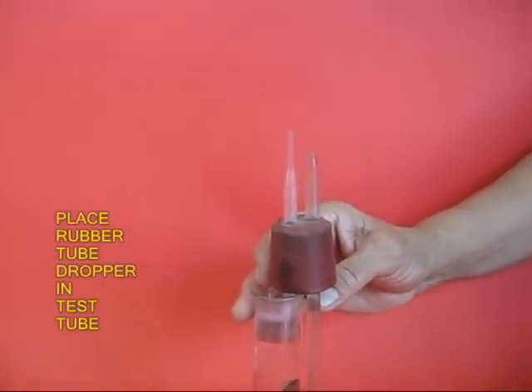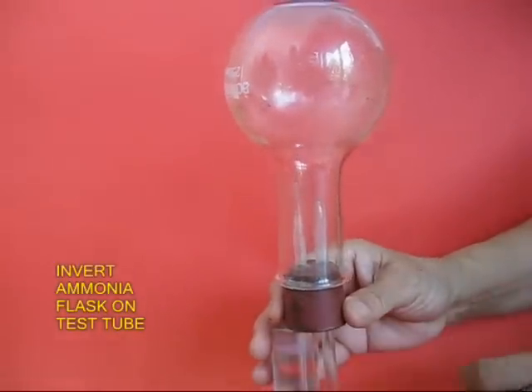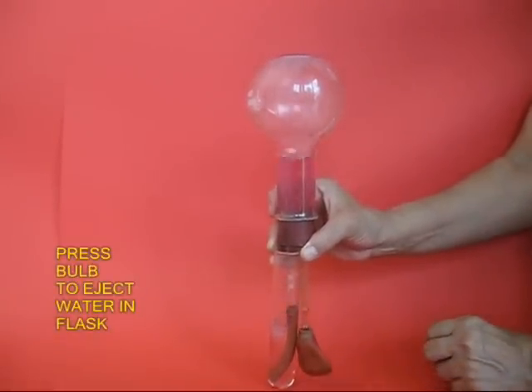In this cork, tight-fit the round bottom flask. Now as you press the bulb, a little water will go into the flask and the fountain will start.